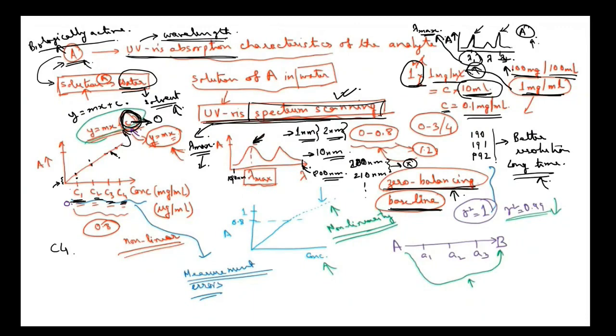To avoid this condition, you have to put the constraint of C equals 0 while you are doing the modeling. Thereafter, whatever straight line you get, you have to accept that.